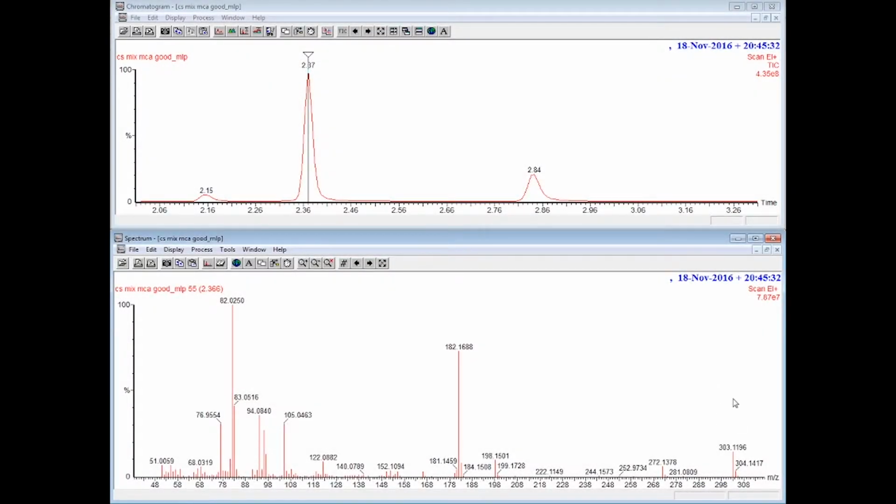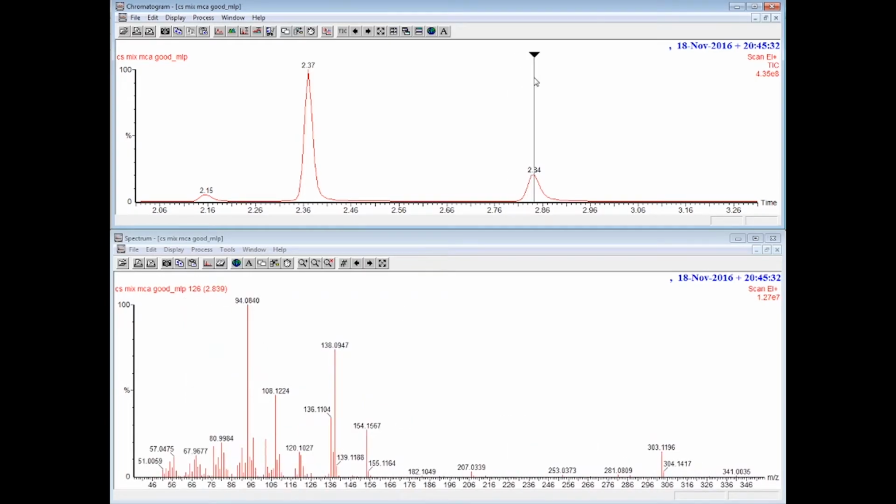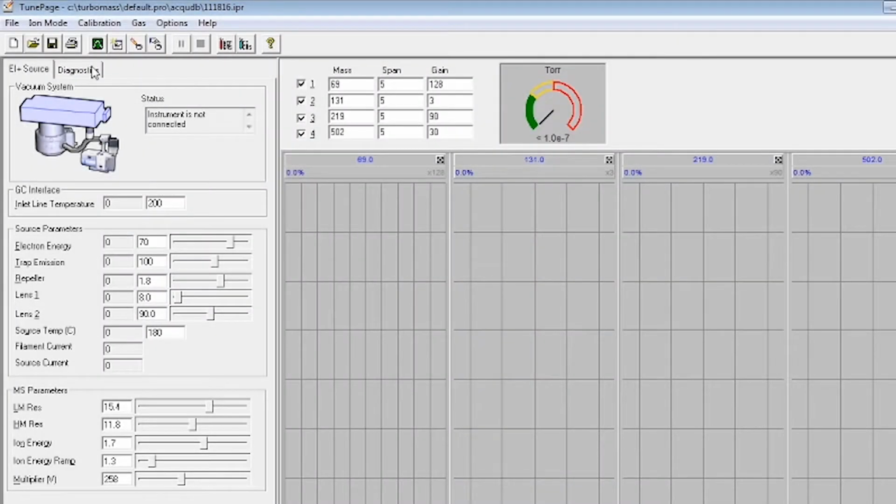So if we take a quick look again at the cocaine and scopolamine peaks, we see the largest peak is, in fact, the fragment at 82, and there's a bunch of fragments there. But this makes sense now because we're operating at 70 electron volts, and we are, in fact, breaking a bunch of bonds. We do get a little bit of the molecular ion at 303 for each of them, but we get lots of useful fragments.